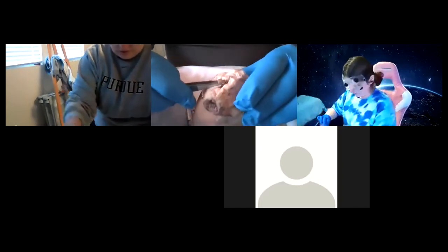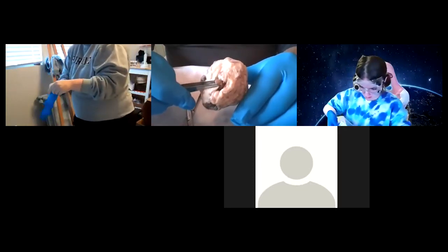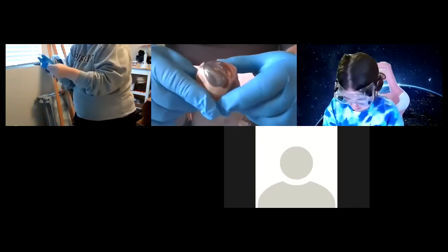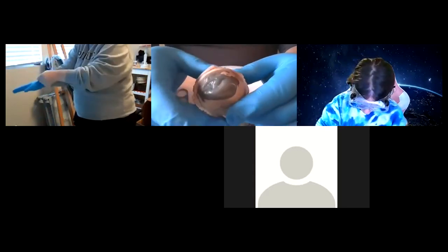This is important that you see — this is one of the things you want to label, and it will be on the practical. The optic nerve for sure. Cut that material away carefully — you don't want to pierce it. Now, the anterior chamber of the eye.